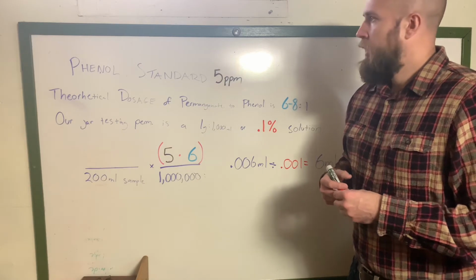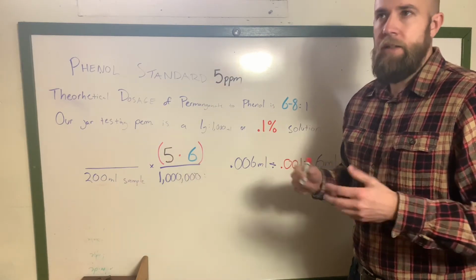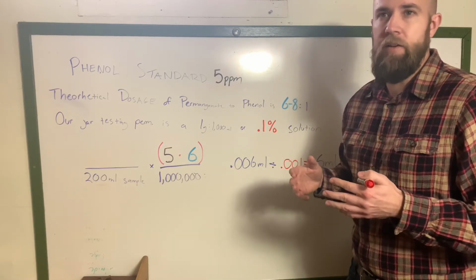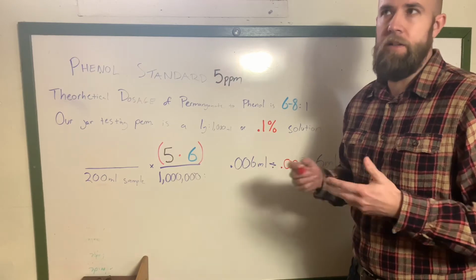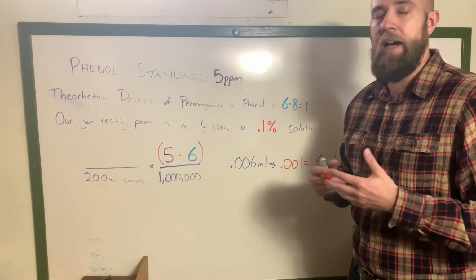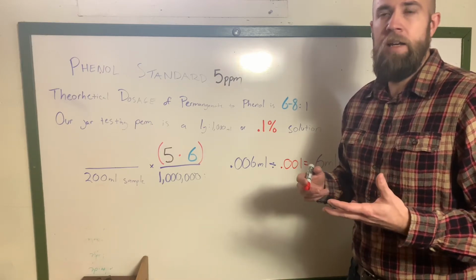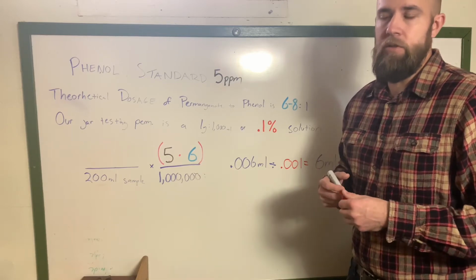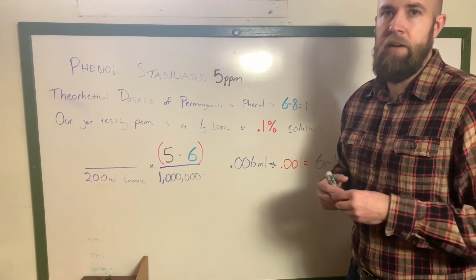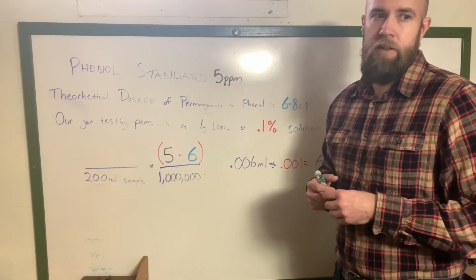So to handle that, really, permanganates are a great option. Basic coagulation and flocculation won't really do it. The first step is finding out, what is their phenol limit and what is their actual. The next step is getting a sample of permanganate. I highly recommend, for safety purposes, you get a small amount of dry that you can make down into a weak solution. A normal 20% to 40% sodium permanganate is not really something you want to be messing around with. In a lab setting, even in the field, even worse.